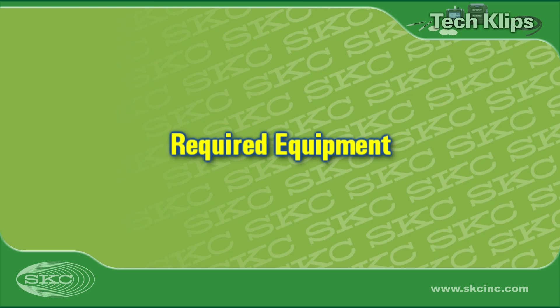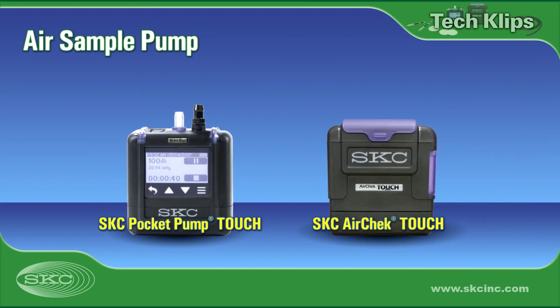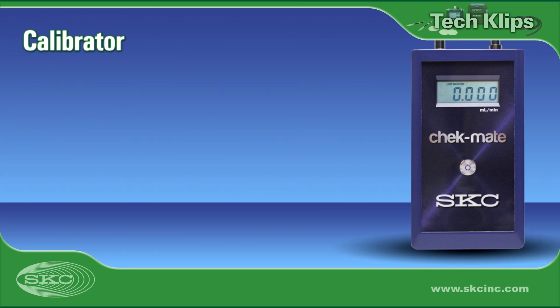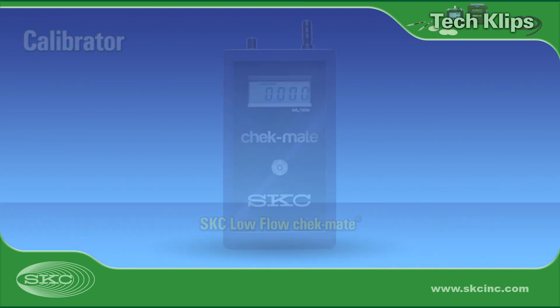Assemble equipment required for pump calibration and low-flow sampling. Choose a pump with a low-flow range less than 1 liter a minute, such as Pocket Pump Touch, or a higher-flow pump such as AirCheck Touch, which can be adapted for low flow. Select a calibrator within your application flow range, such as the SKC Low Flow Checkmate. Use method-specified sorbent tubes.